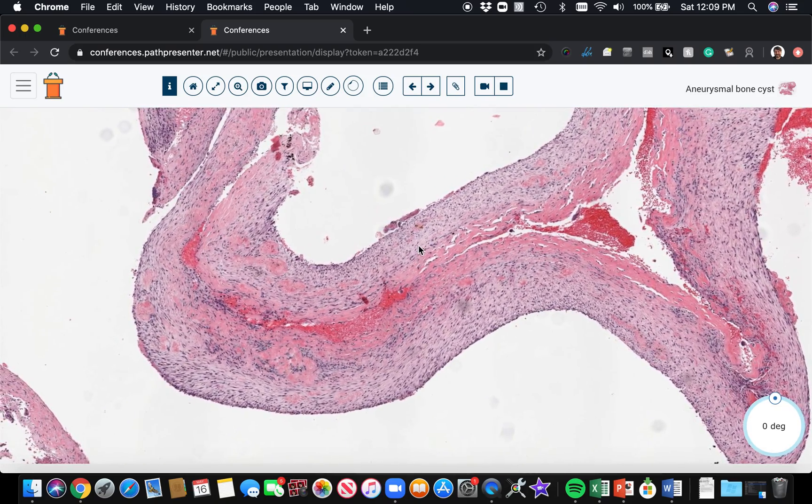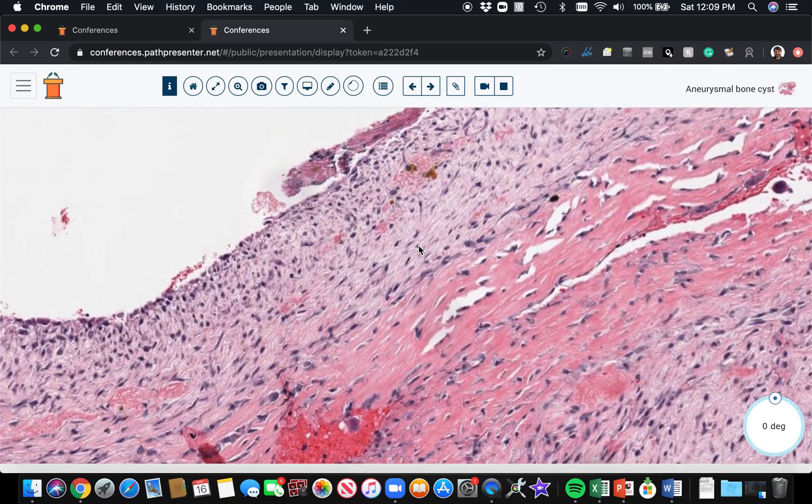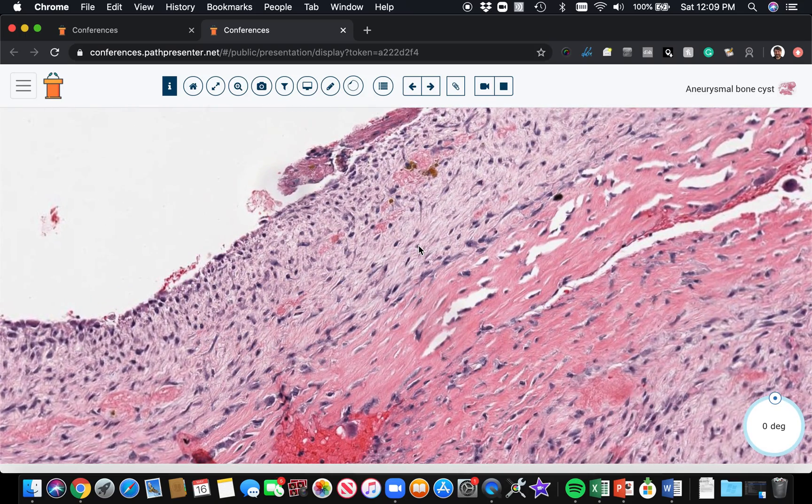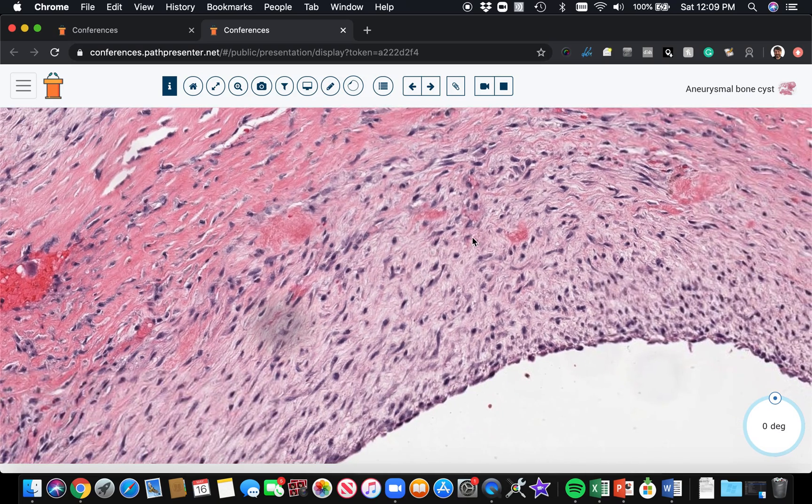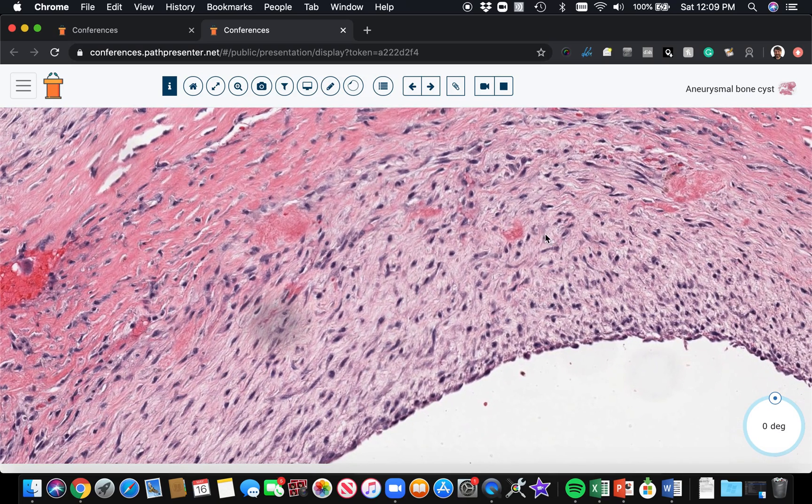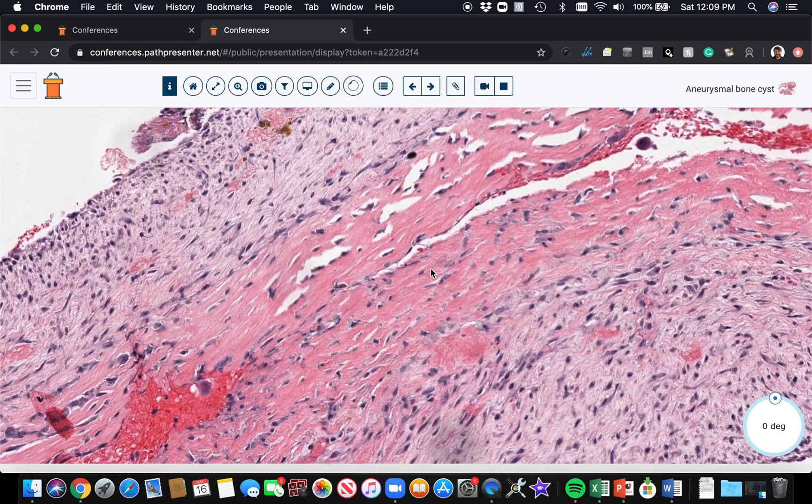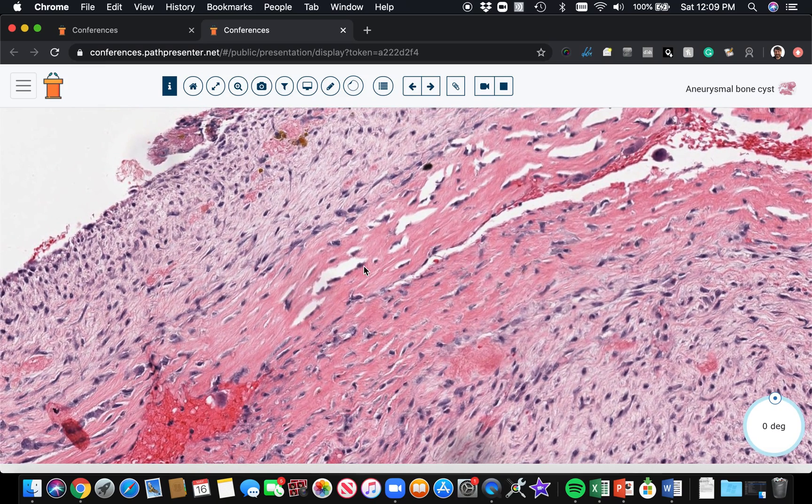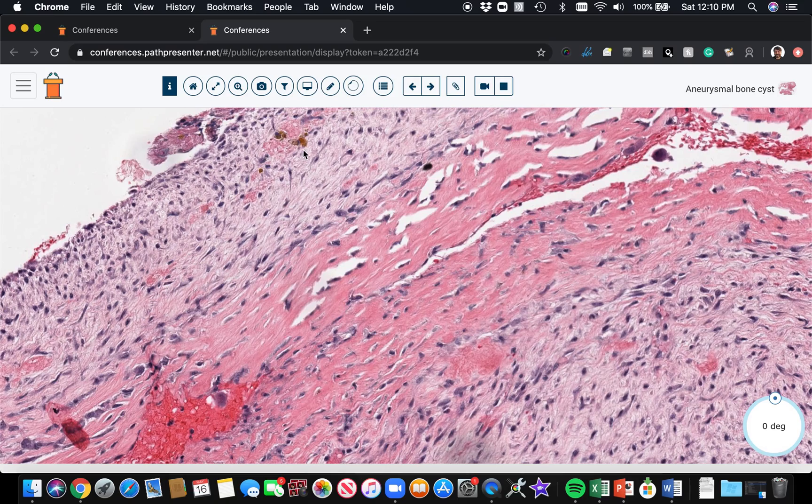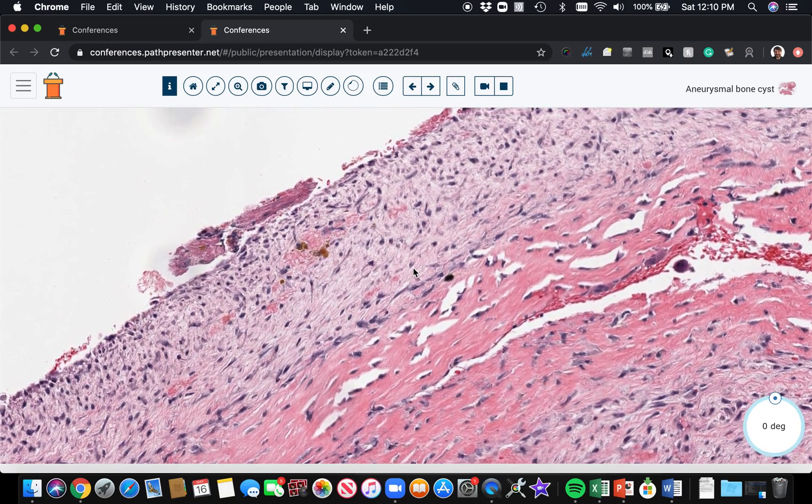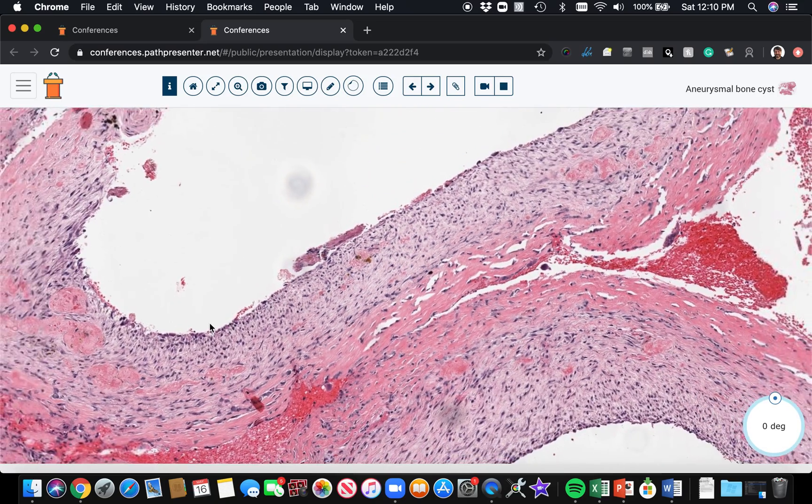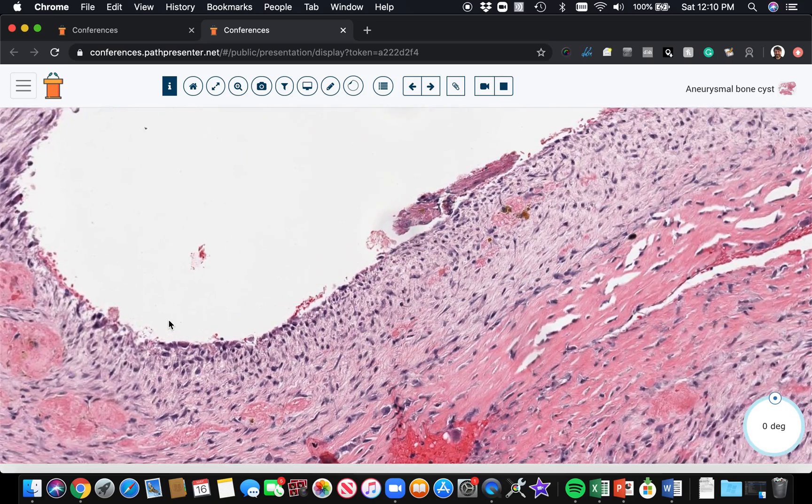Kind of resembling granulation tissue or fasciitis actually. See how they kind of look like myofibroblasts that are loose and spindled, and then there's some dense collagen in the background. Here's some hemosiderin.